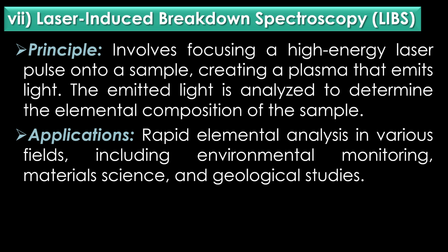The seventh type of emission spectroscopy is laser-induced breakdown spectroscopy. Laser-induced breakdown spectroscopy or LIBS involves focusing a high-energy laser pulse onto a sample, creating a plasma that emits light. The emitted light is analyzed to determine the elemental composition of the sample. Regarding applications, it is used for rapid element analysis in various fields, including environmental monitoring, material science and geological studies.